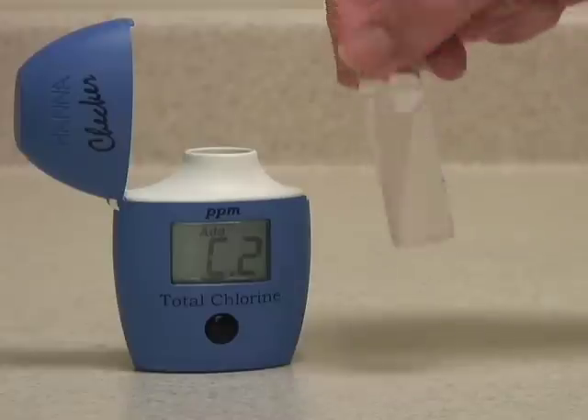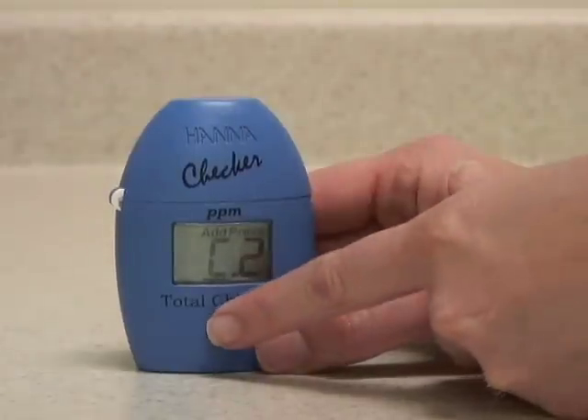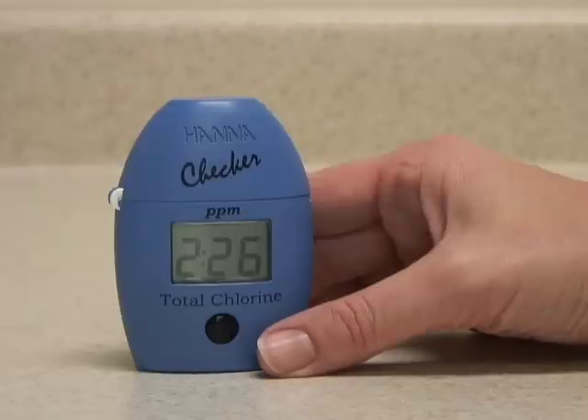When the reagent is mostly dissolved, put the vial back in the meter, close the cap, and press and hold the button to activate the read-timed function. The meter will now count down 2 minutes and 30 seconds before analyzing the sample.